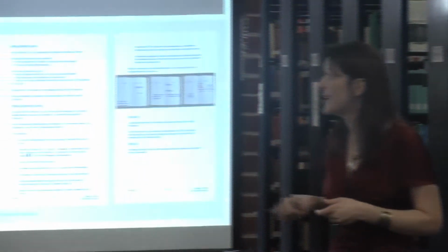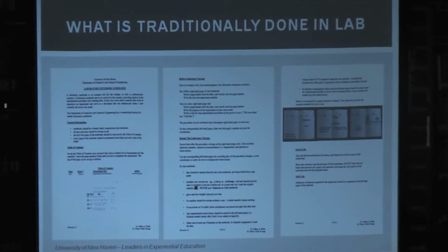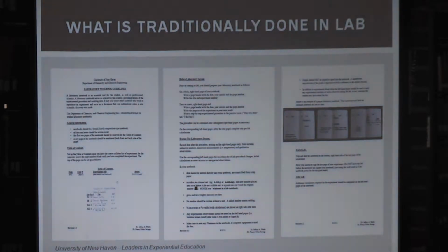And we actually have these guidelines that our freshmen and our sophomores get, maybe a little bit of variation for the sophomores. And we want them to get good lab notebook techniques so that when they go to their junior and senior classes, they have a good foundation. Okay, they have good habits when it comes to lab notebooks.